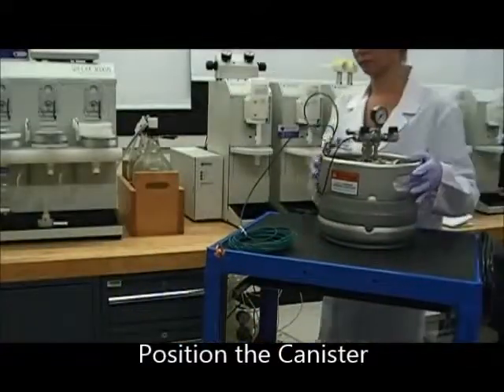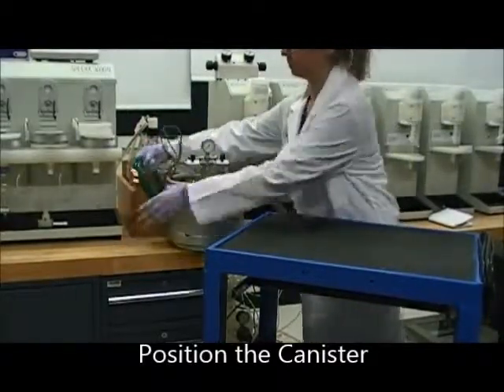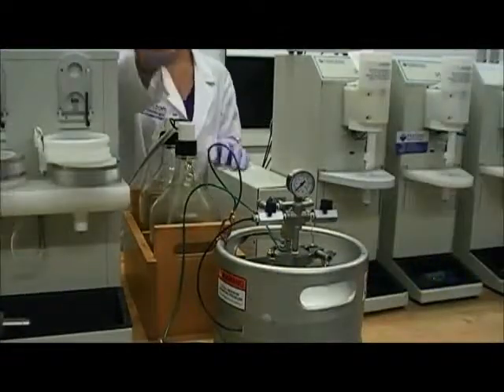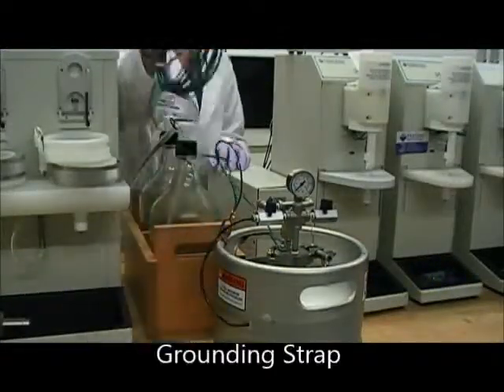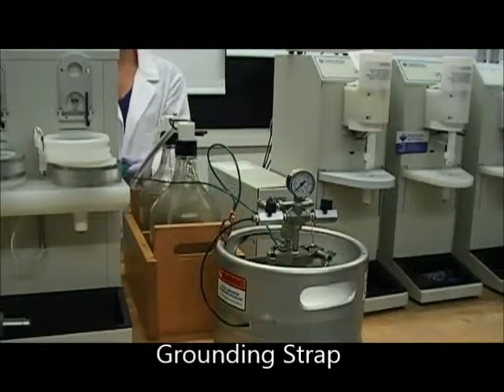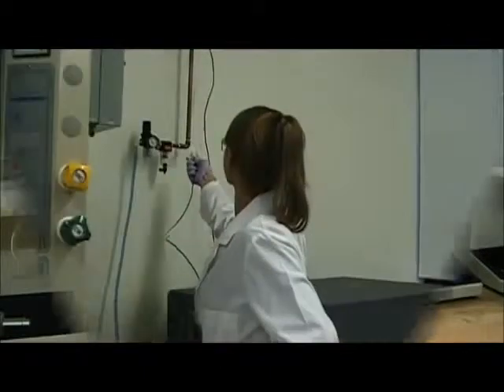Position the canister next to the 3000 where you want to transfer the connections from the plastic coated glass solvent bottle. Static discharge is a hazard especially near solvent, so the first thing that we'll do is connect the static discharge grounding wire. This needs to be connected to a true ground.